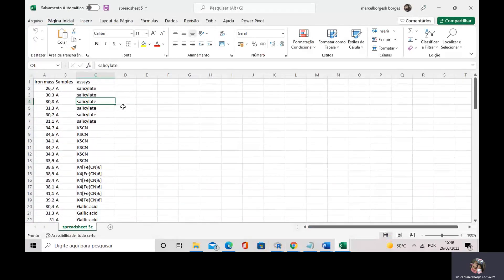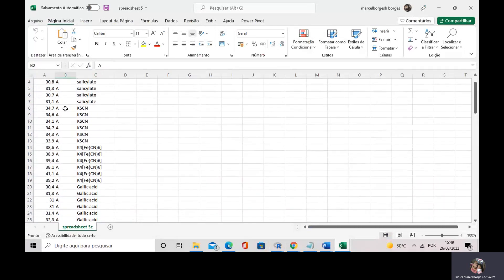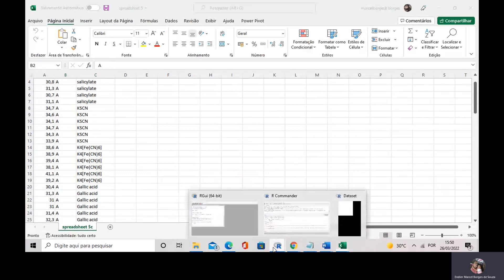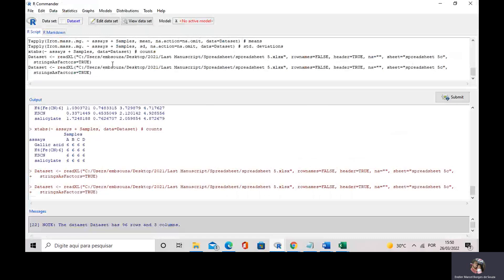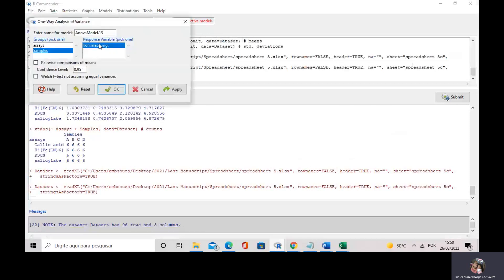The first thing I want to see is if there was some difference between the masses of iron in just dietary pills. To do that, I will do one-way ANOVA. I go to Statistics, Means, and I go to One-Way ANOVA. I am going to select samples and iron mass. Here you have a group variable and here you have a response variable.